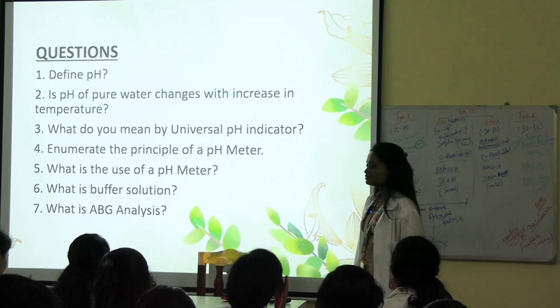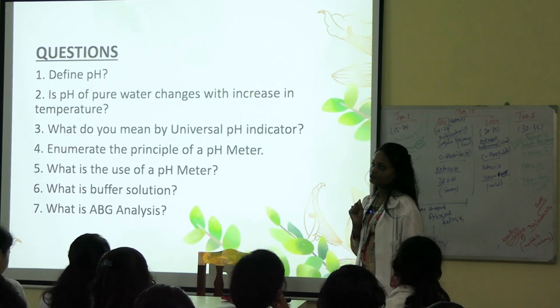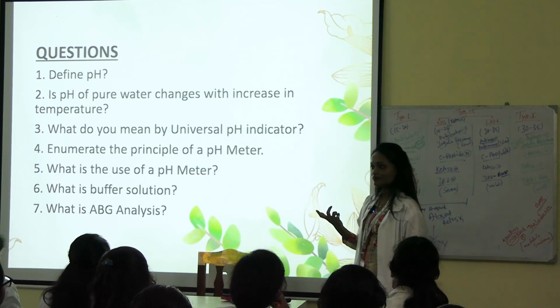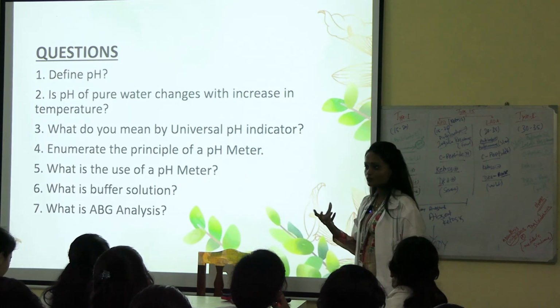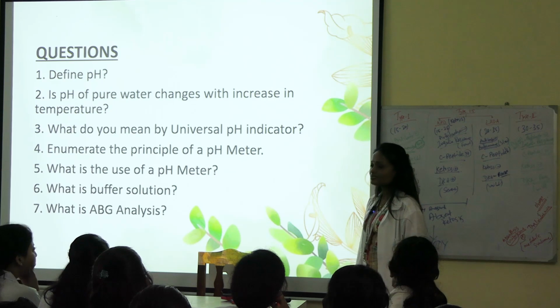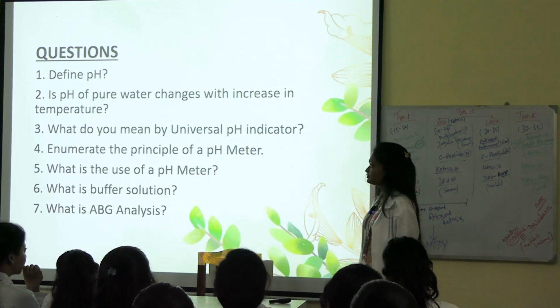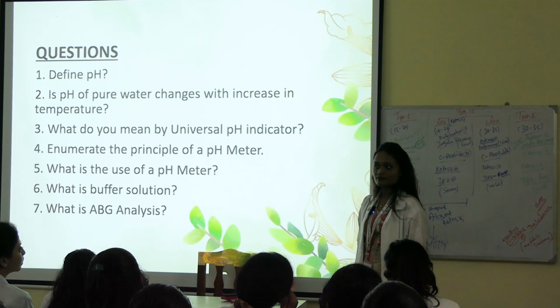Why radial artery? For this instrument, to test. Like in angiography, radial artery is also preferable. For some procedures, some artery is more comfortable to do the test, that's why it is more preferable. It's tough to do in femoral artery, so this is less preferable. Understood? Okay. So we'll perform the pH measurement with the pH meter in our lab.